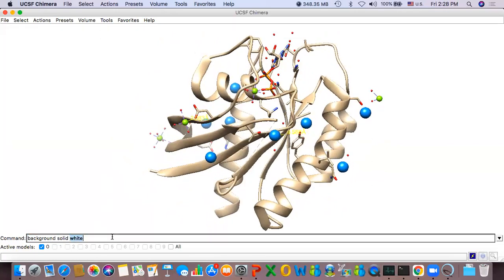Another thing that you can do is, instead of selecting a residue by clicking it, you can use a command called select, and there is a certain format that you write it in. So you do select and then use a colon. Now before the colon there is, you see this just below your command. Are you able to see my screen by any chance?